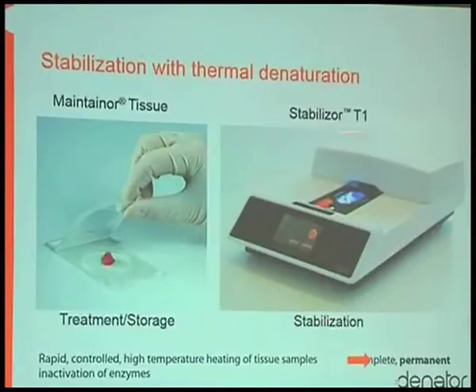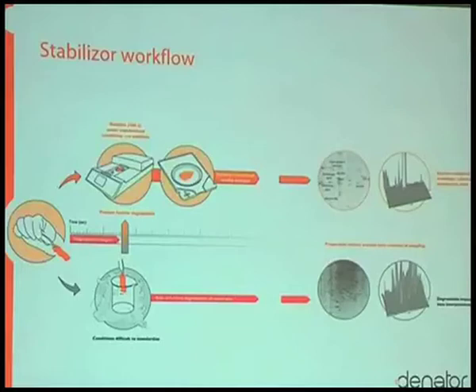So we have the instrument itself. There is a cartridge for solid tissue, a cartridge for liquid samples, and also a cartridge for DBS, dried blood spots. This system can be used very close to the sample source, introducing the sample directly into the instrument.